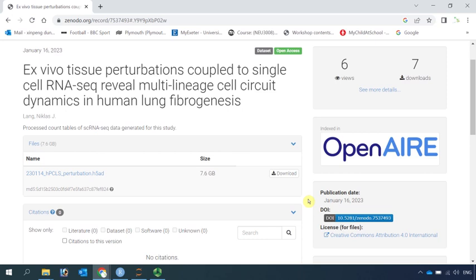The data that I'm using could be downloaded from this website. In this study, they used human precision cut long slices and treated with different drugs, then performed single cell RNA sequencing analysis. So we can download the data from here. You can see the size is very big — it's 7.6 gigabytes.